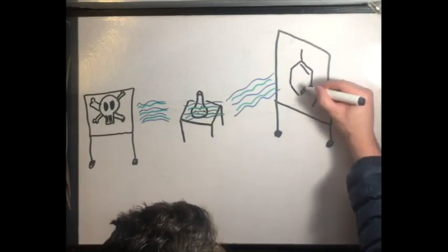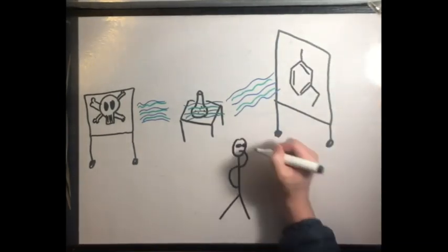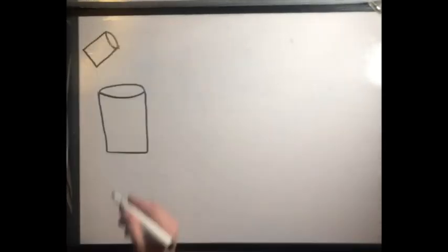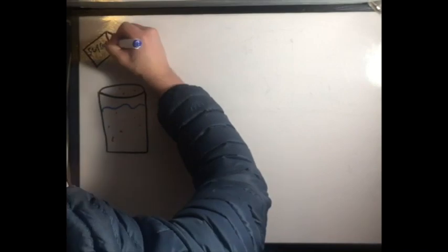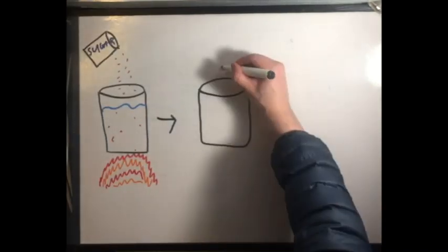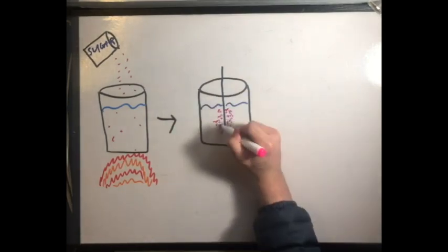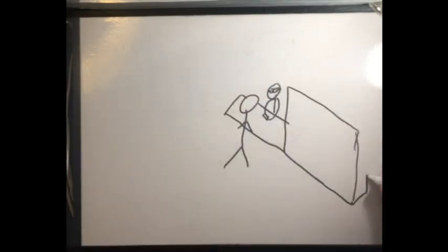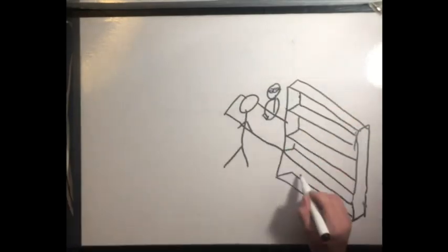Because of the purity needed for this process though, unlike our example, their samples are left to cool over weeks or even months to ensure the structure has formed correctly. The process of recrystallization is even used in the production of some food, mainly sweets such as rock candy. This is done with a supersaturated solution of water and sugar, which is then heated and allowed to cool, forming the precipitate that we then extract and consume.